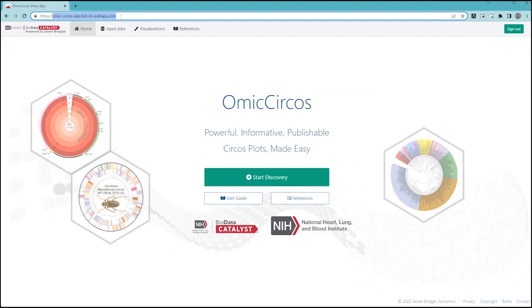It's not public. This is an interactive way to do your analysis, and it works very well for things at the end of your analysis, like visualization, because the data is already reduced in size, and you want to fine tune things.